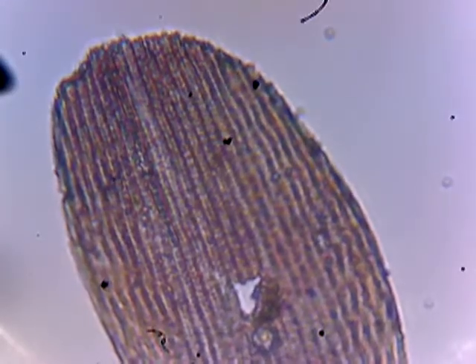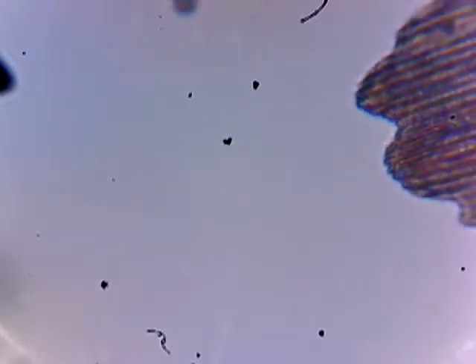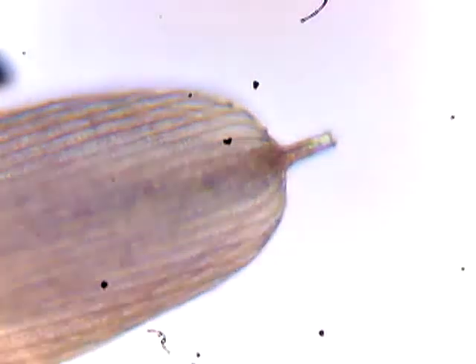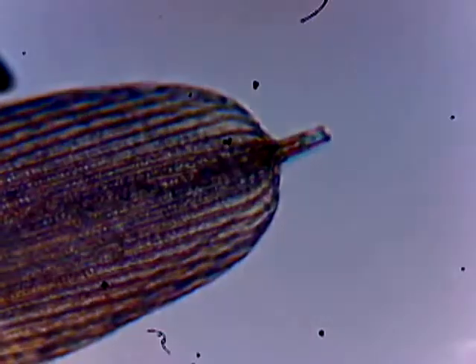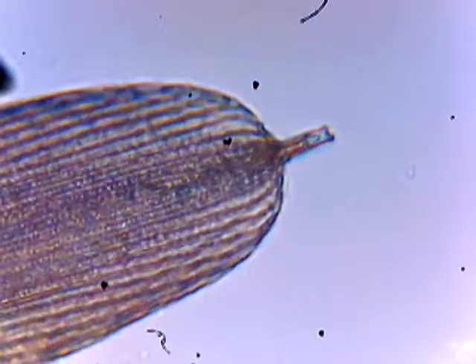There's a nice non-lobe scale. Check out the intricate details now that you can see. They're ridged, but I think maybe what you're looking at there isn't really ridges per se — I think it's cellular structure. That'd be my first guess. Here's a nice look at the lobe of one of the more flowery-looking ones. You can see the stem, for lack of a better way to put it, that connects the scale to the wing. Notice how you lose contrast so quickly adjusting the condenser. And also the iris here — see how much more contrast I can give it. Bring up the light power and now details stand out very sharply.